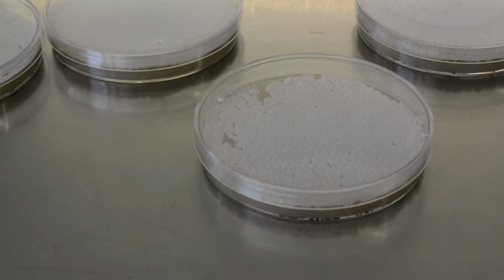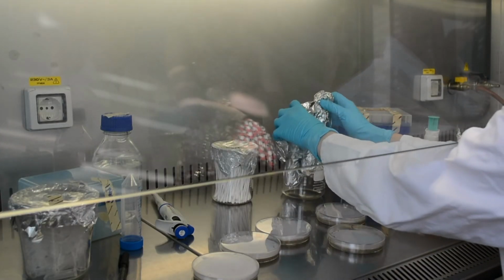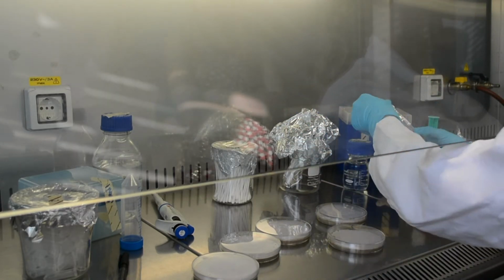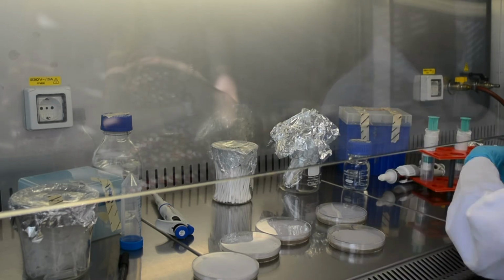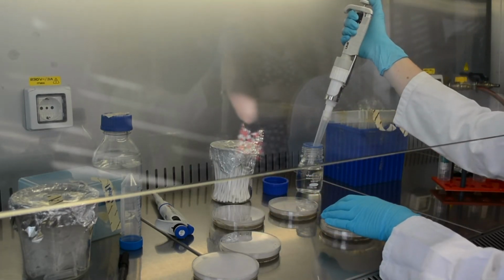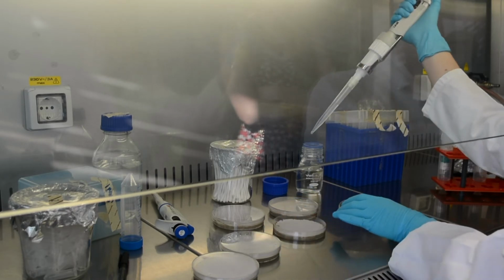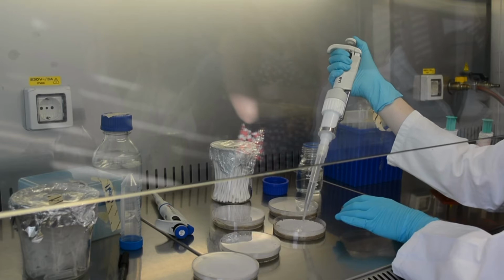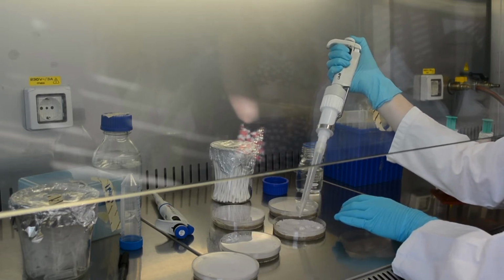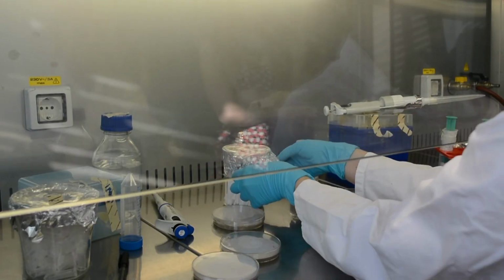After the preparation of MS agar plates, unpack the autoclaved syringe, which is plugged with absorbent cotton and fixated in a 50 ml falcon. Now pipette 5 ml of autoclaved water on each plate. You can see that the surface of the colonies is hydrophobic. This is due to special peptides on the surface. After scratching away the spores, the hydrophobic surface will disappear.